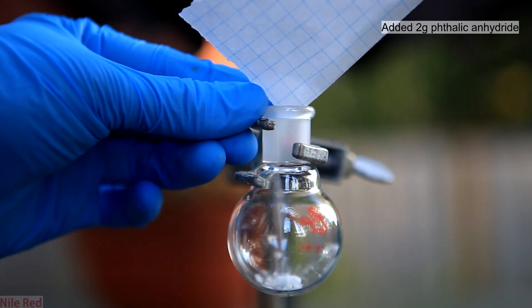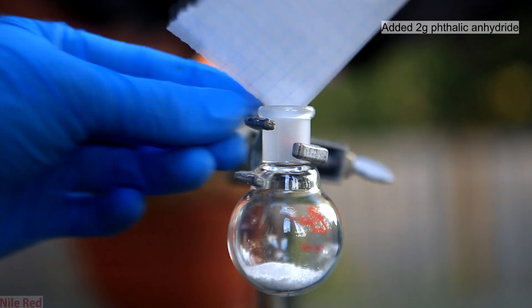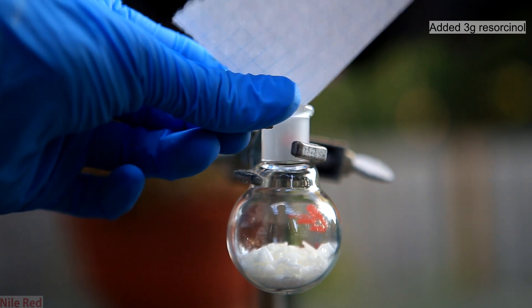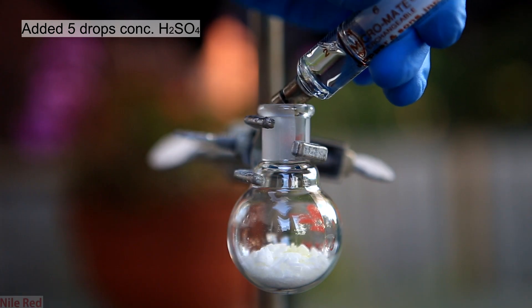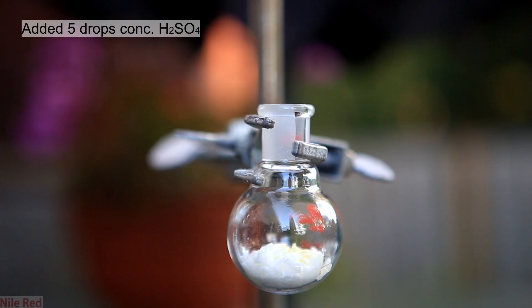I start out by adding 2 grams of phthalic anhydride to a small round bottom flask. And then on top of this I add 3 grams of resorcinol. And then to this I add 5 drops of concentrated sulfuric acid. Ideally the chemicals would have been mixed up before adding the acid, but oh well.